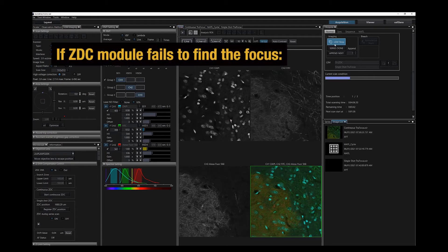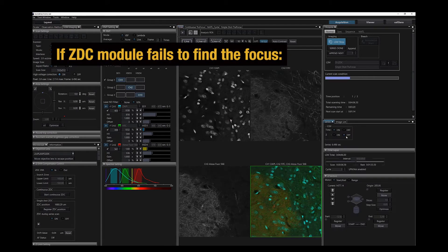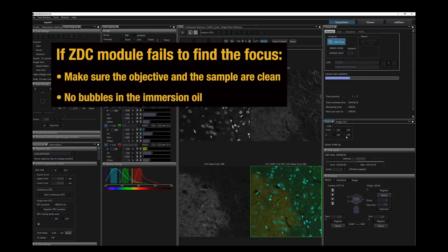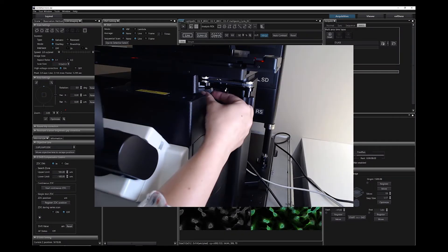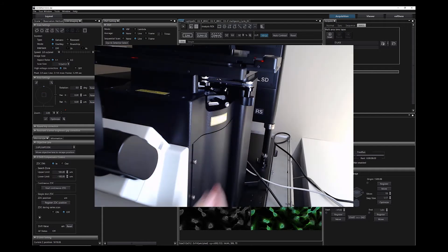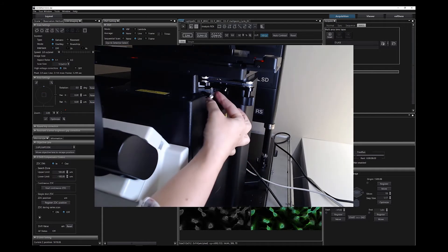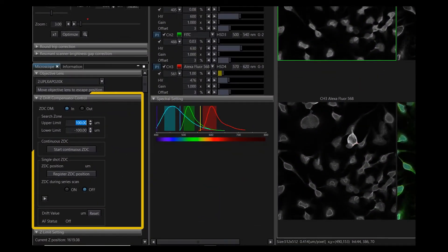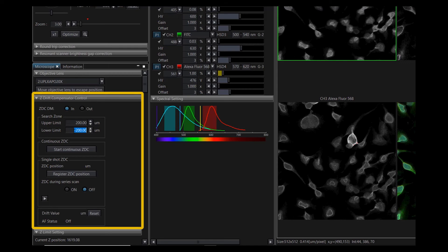If the TrueFocus ZDC module fails to find the focus, there are a few things to test. First, make sure that the objective and the sample are clean and that there are no bubbles in the immersion oil. Remove the DIC prism under the nose piece or adjust the shear of the prism by rotating the thumb screw so it is in the middle of the rotatable range. Lastly, you can extend the search from a default of plus 100 to minus 100 microns by adjusting the upper and lower ranges slightly until the TrueFocus module finds the correct focus position.